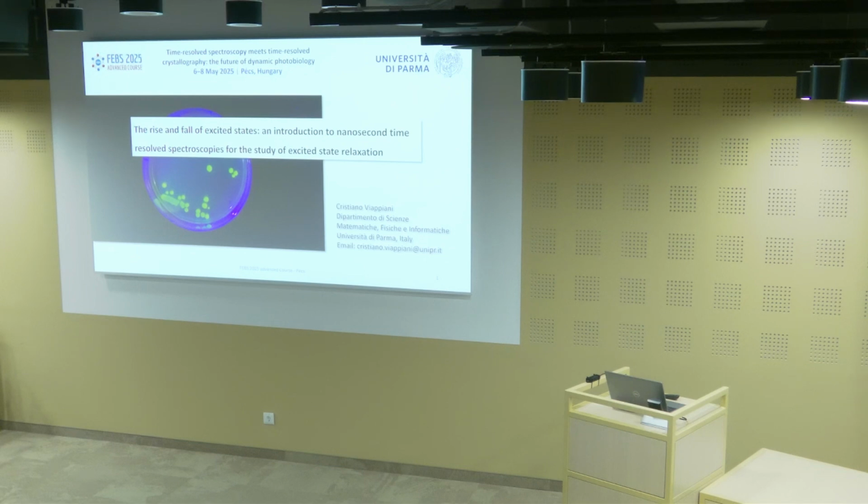Spectroscopy methodologies, it was really difficult to make a choice because, as you know, there is a plethora of methodologies with pros and cons for various applications. So I decided to follow one leitmotif, which is a specific type of molecular device, photosensitizers, which are very useful for presenting methodologies with time resolution in the range of the nano to micro to milliseconds. So I will not touch on ultra-fast spectroscopies.